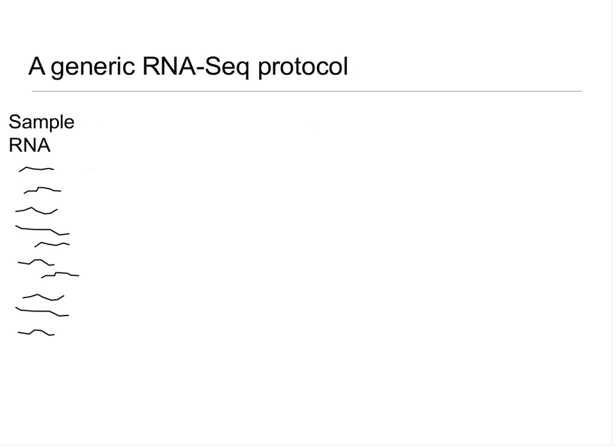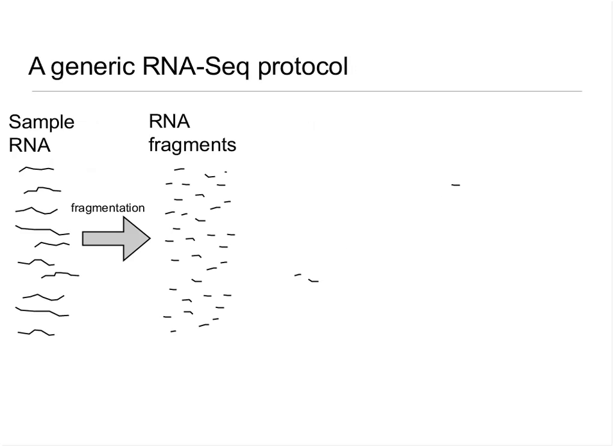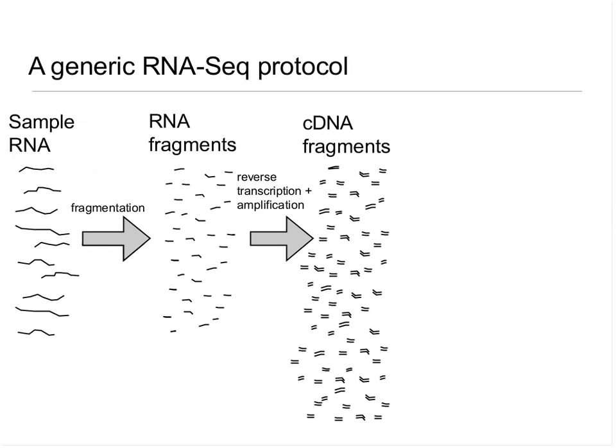So I'll give a little bit of an overview of RNA-Seq technology just in general, for all cases. Typically one starts out with a sample pool of RNA shown on the left. There are a number of different protocols that are used for RNA-Seq, but the one that I'll show is maybe the more standard one right now. In that one, you start out by first fragmenting your RNA into a number of small RNA fragments. Then through both reverse transcription and an amplification step, you obtain a set of amplified short cDNA fragments that are derived from that RNA.